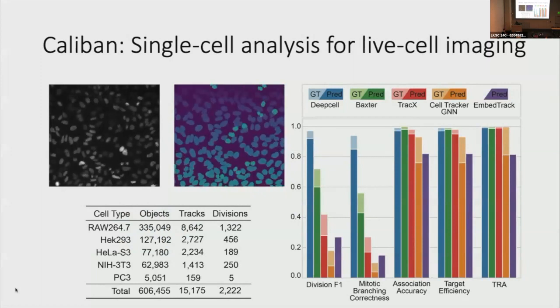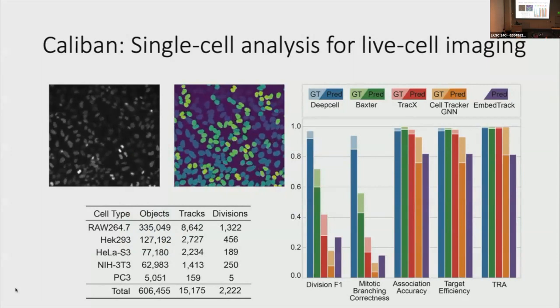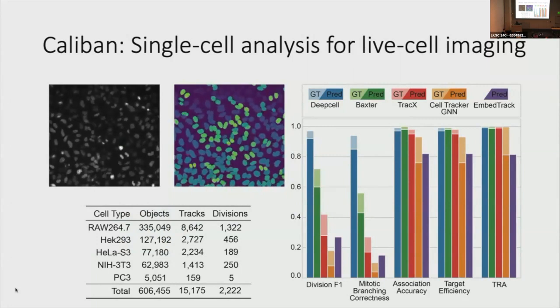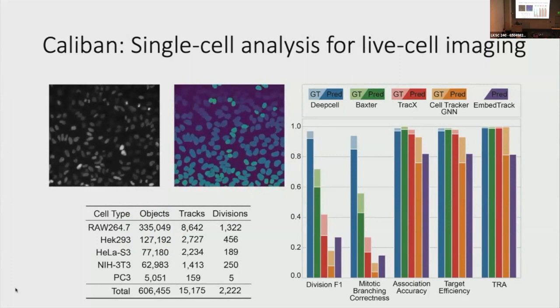It's a data set similar in size to the original TissueNet, but now you have this temporal consistency constraint imposed, and then also these dynamic events. And with this data set, you can create models that do both segmentation and tracking. And not surprisingly, because it's just seen many more examples, it performs much better on the cell tracking problem.